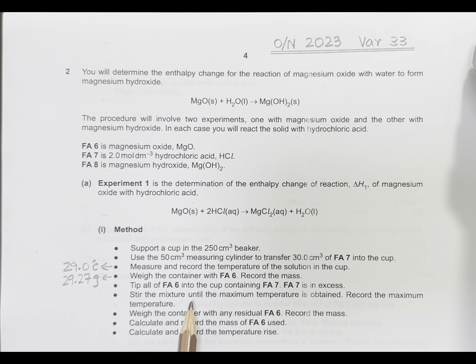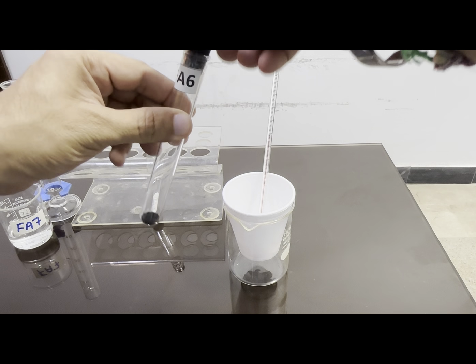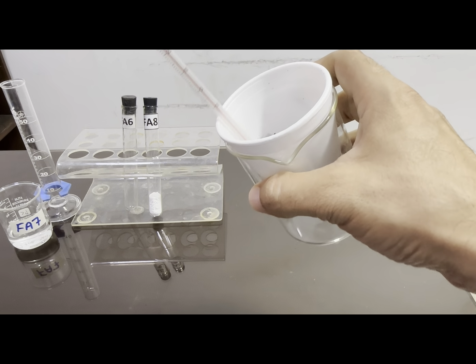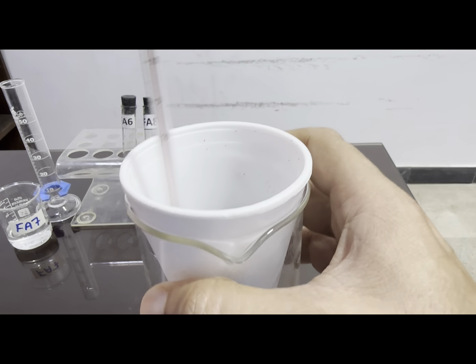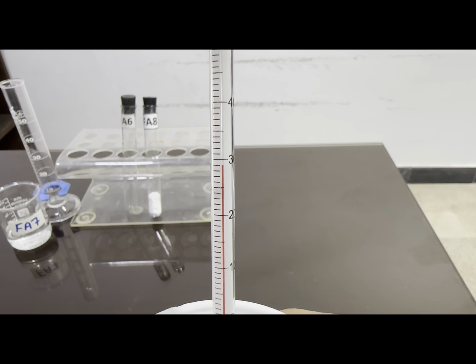Stir the mixture until the maximum temperature is obtained and record it. Let's add FA6 and stir the mixture until the maximum temperature is reached. Keep stirring and looking at the temperature.